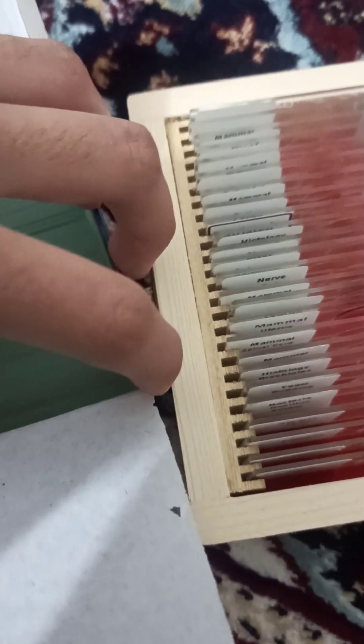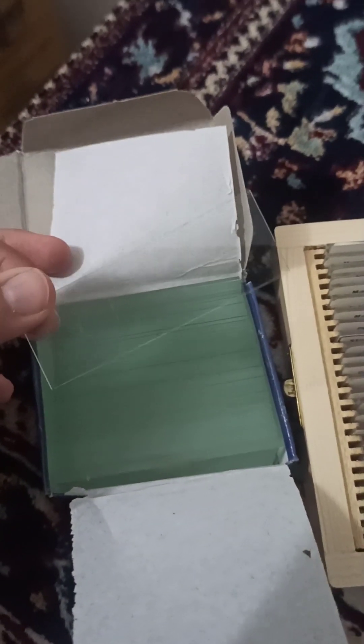These are very general slides. You can also buy the set with 50 slides; I have bought these and decided to make the rest of the slides myself. These are the 50 glass slides provided — they are very fine quality glass. We also have cover slips.